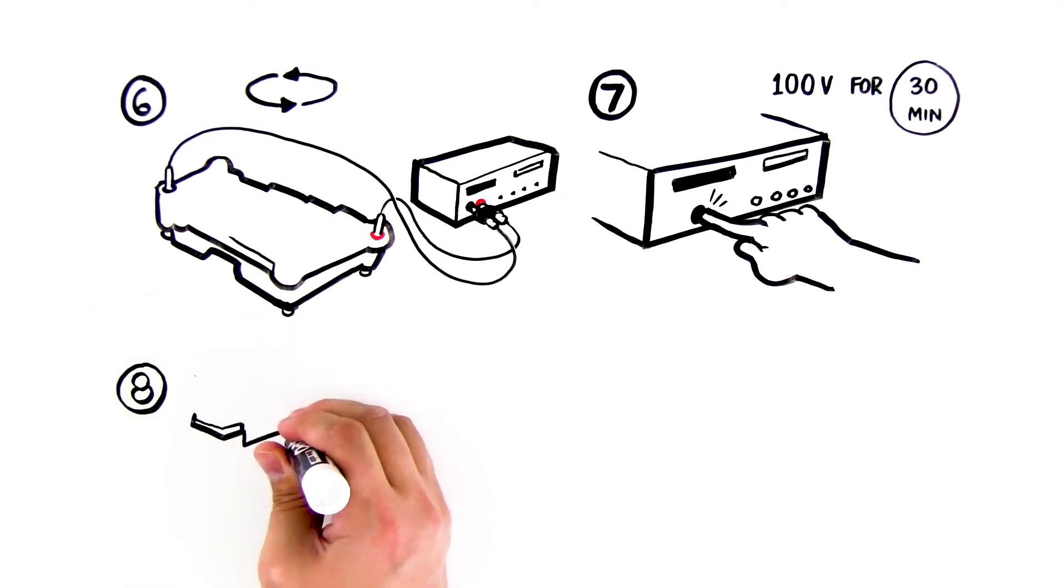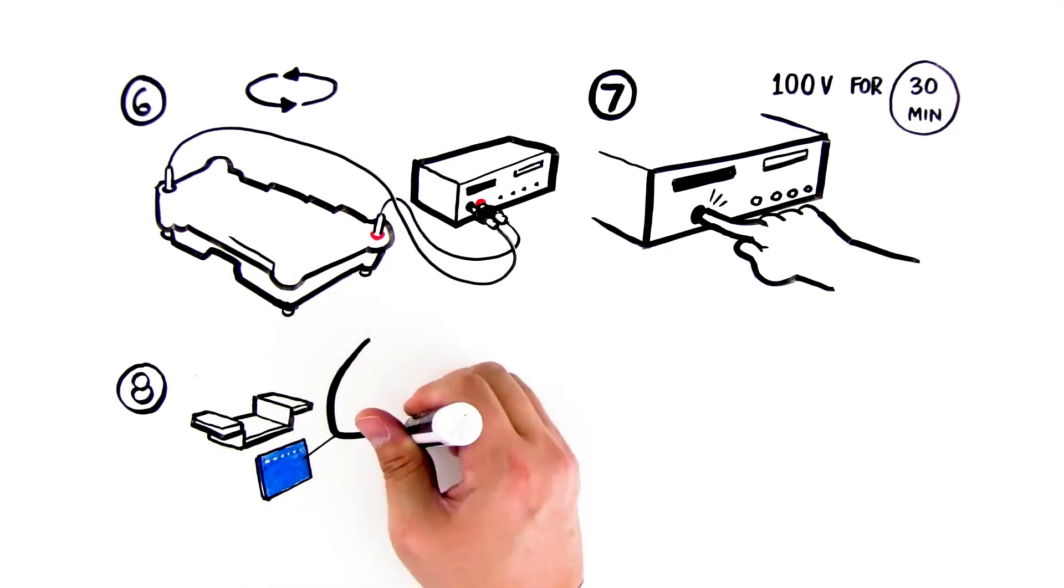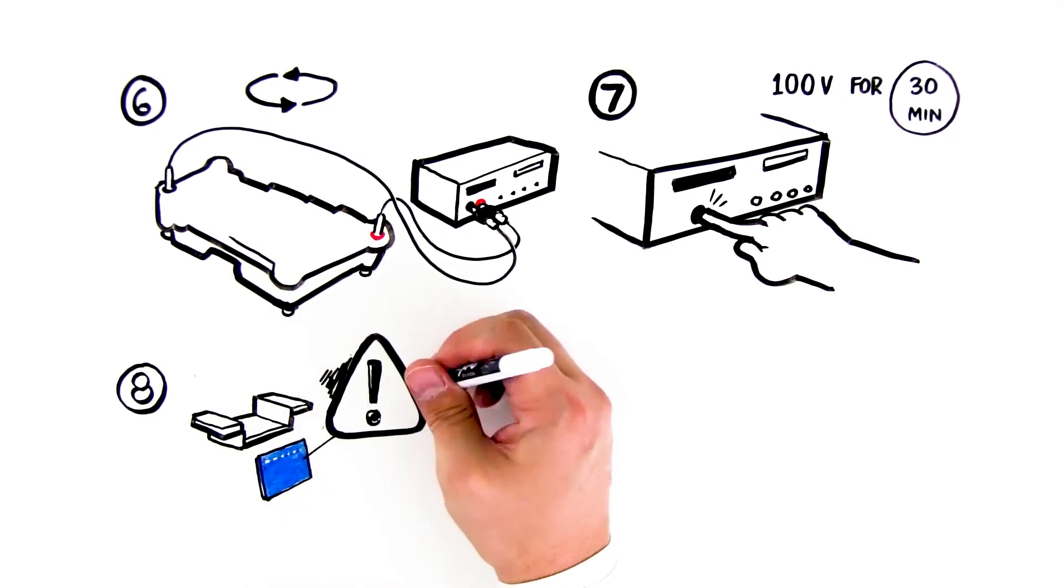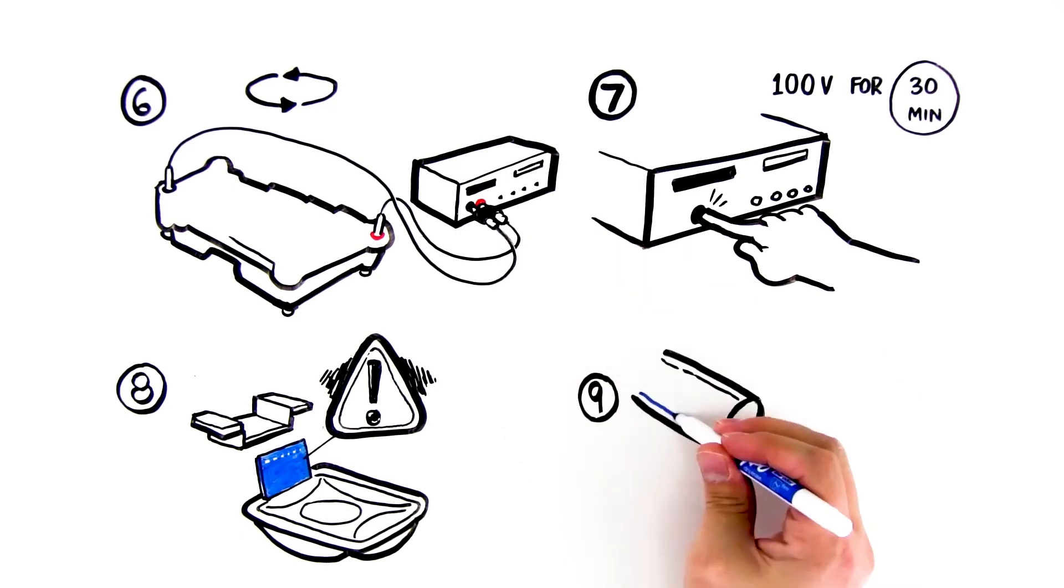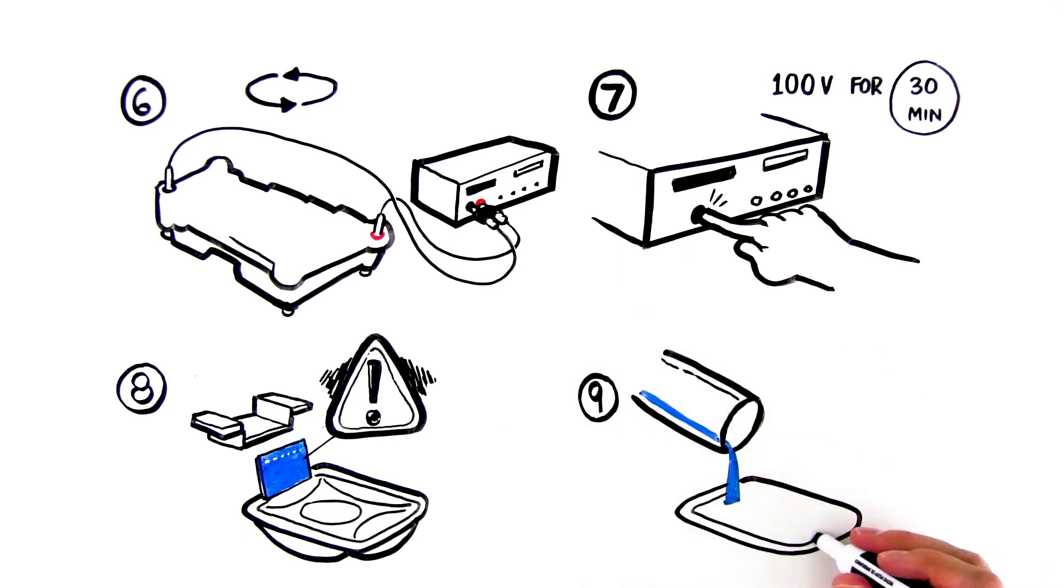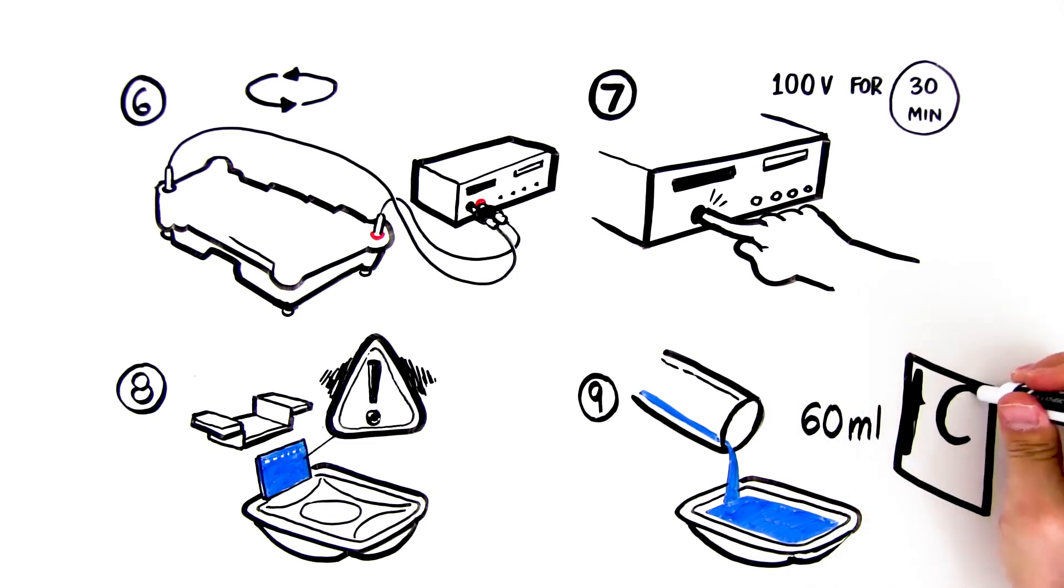Eighth, when the electrophoresis is complete, turn off the power and remove the top of the gel box. Ninth, carefully remove the gel and tray from the gel box. Be careful, the gel is very slippery. Slide the gel into the staining tray. Add 60 milliliters of DNA stain to the tray. Cover the tray with plastic wrap. Let the gel stain overnight, with shaking for best results.